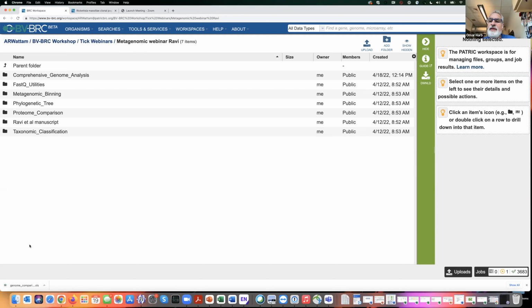Oh, I see. Dina, yes, please. Go ahead, Dina. Thank you very much for this useful seminar. I am a microbiologist, so I am interested in the bacteria in the ticks, but I couldn't deal with the eukaryotic genome. So how can I separate and work only on the bacterial genome?